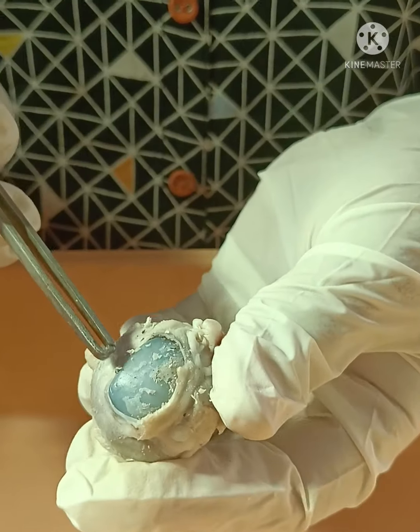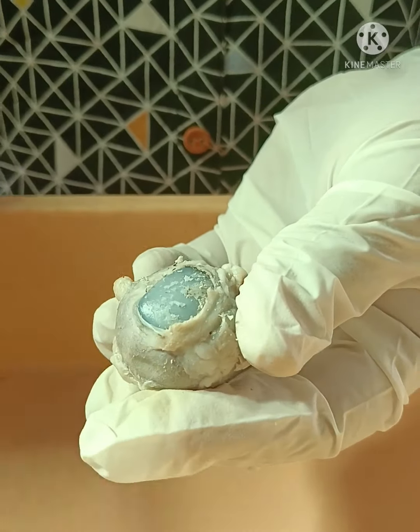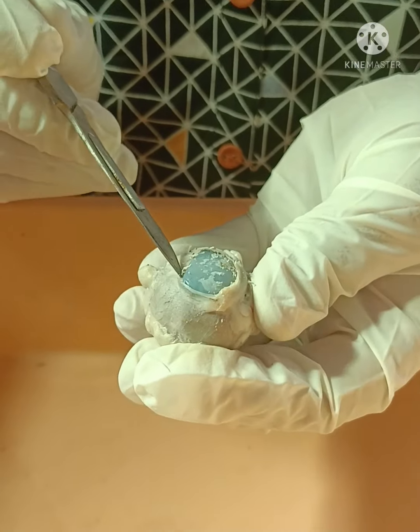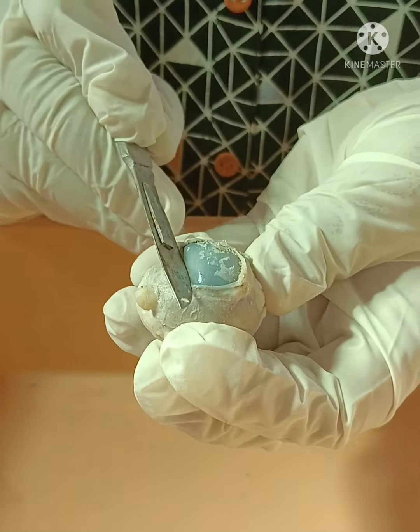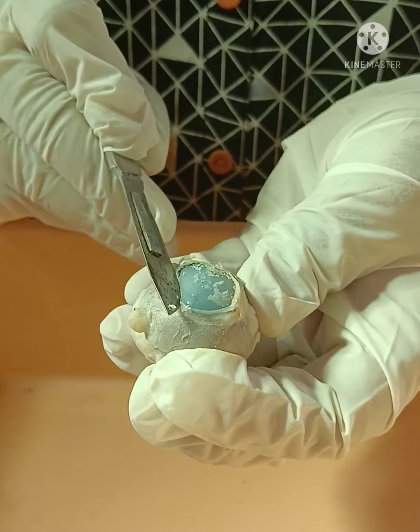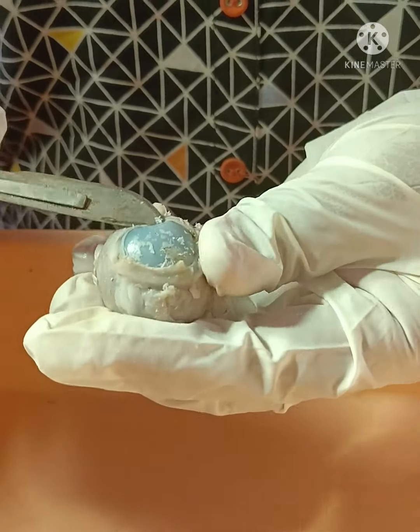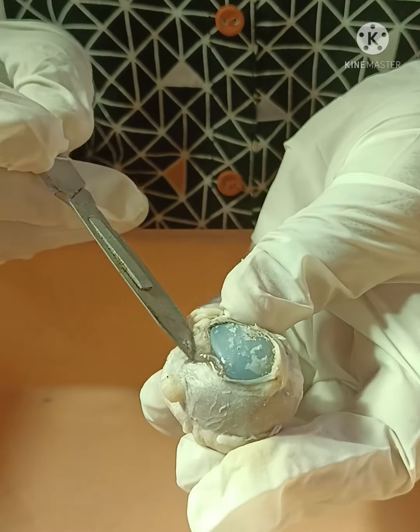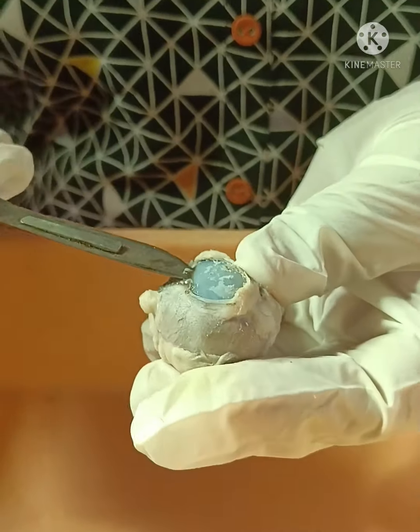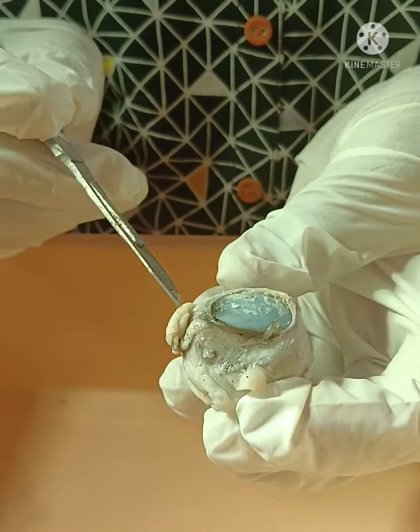To see the internal structures, I'm going to give an incision at the limbus portion, the sclerocorneal junction. Then we can see the internal layers, the middle coat, which we call the uveal tract. The liquid which comes out while giving the incision is the aqueous humor.